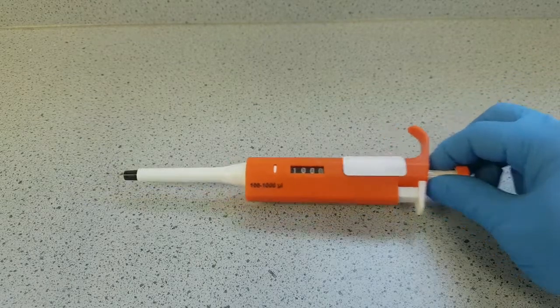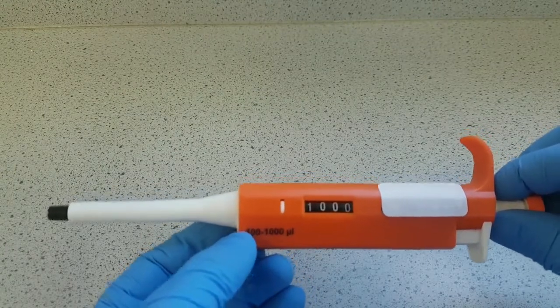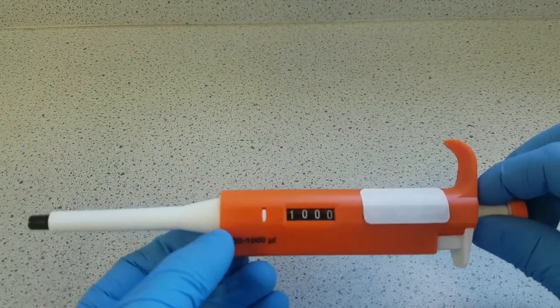In this video I'm going to be showing you this particular auto pipette, which has a volume of 100 to 1000 microlitres. There are 1000 microlitres in a millilitre, so this has a maximum capacity of 1 millilitre.